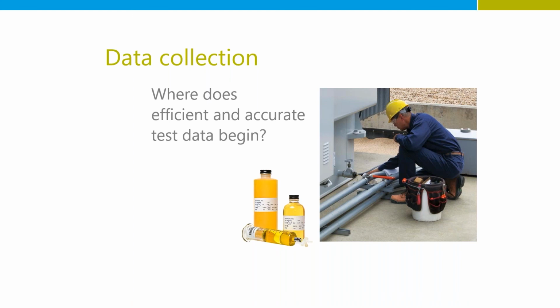Great question, Mark. You know, when we talk about laboratory and data analysis and data acquisition, really this begins in the field. And the question is, how efficiently, how accurately can we gather that data? We want to be only touching that data once. If we're retyping or hand entering data that's entered on clipboards and such in the field, that's a problem. We should be leveraging mobile technologies. We should be able to provide things like, oh, this fellow here, he's collecting machine cycles or operational hours or whatever. He needs a place to be able to enter that would be verified, so we know that his data is correct. We want to be able to catch any typos. It says, oh, you know, operation hours should only go up, they shouldn't go down. So this is a great place to shield our input data so that it's really accurate and it's presented to the system very accurately.